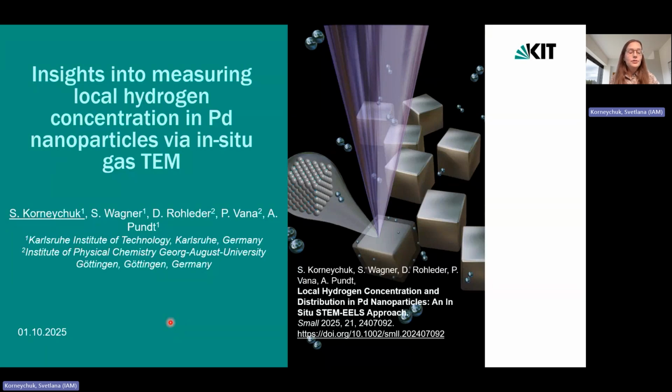And today I'm going to talk about insights into measuring local hydrogen concentration in palladium nanoparticles via in-situ gas TEM. This talk is featuring our recent publication in Small about local hydrogen concentration and distribution in palladium nanoparticles and an in-situ STEM EELS approach.